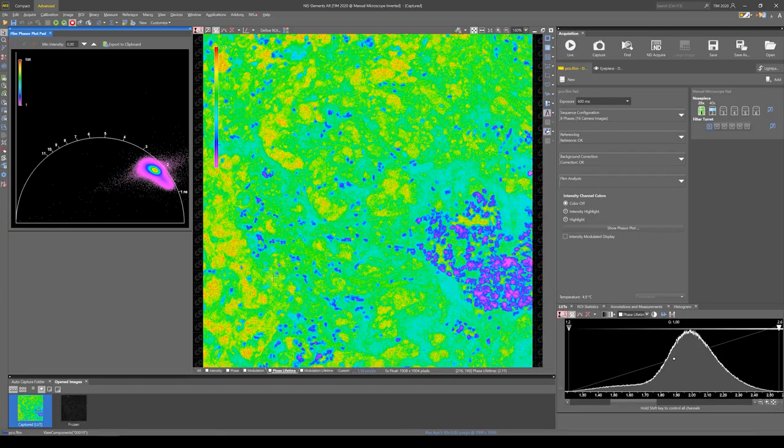And if I would like to access the values, I just point the cursor to any spot, like here, for example, this purple spot gives us a lifetime of 930 picoseconds or 1.2, very short, so that's a patch. Or if I move over here to the purple section, it's around 1 nanosecond, while the yellowish, reddish parts like here are above 2 nanoseconds.